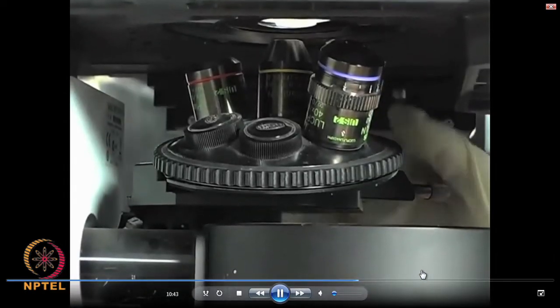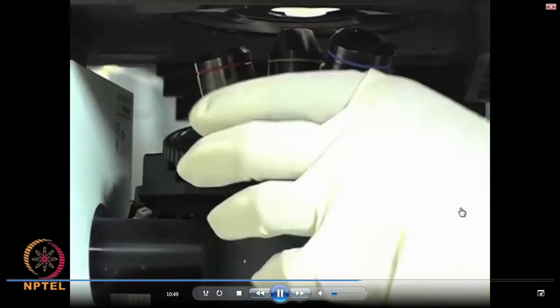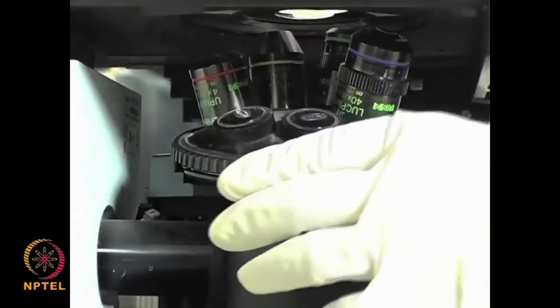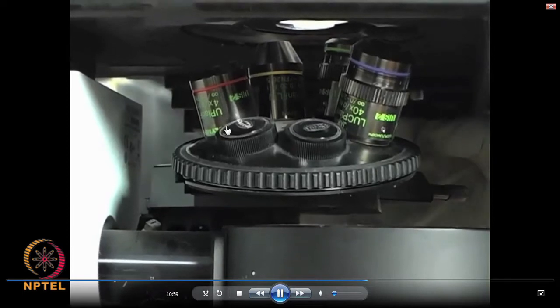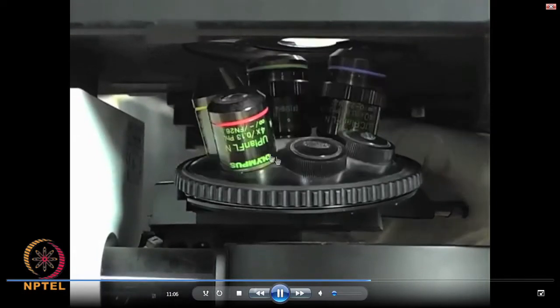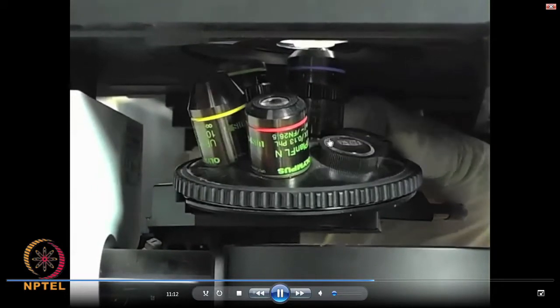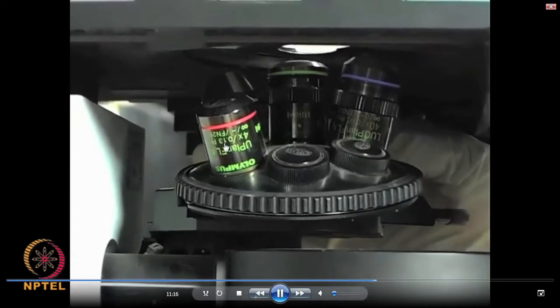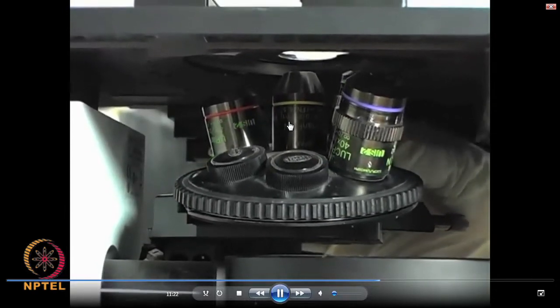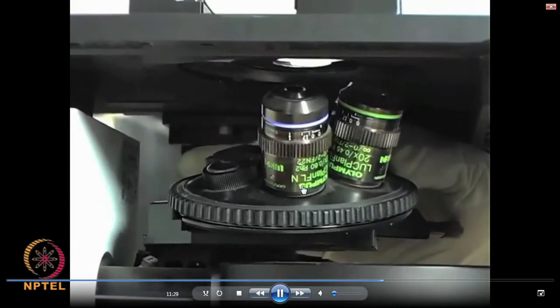Now, you see that all your objectives are kept in an inverted position, compared to the normal vertical type metallurgical microscope. But you can see that you have about 6 slots. These 2 slots are kept empty, but the other 4 slots are filled with different kinds of objectives. You can also see that the details of the objectives are written in these letters, where the magnification details, that is 4x, and then this is some kind of refractive index detail, and then typically this has got 4x, 10x and 20x, and this is 40x or 50x.